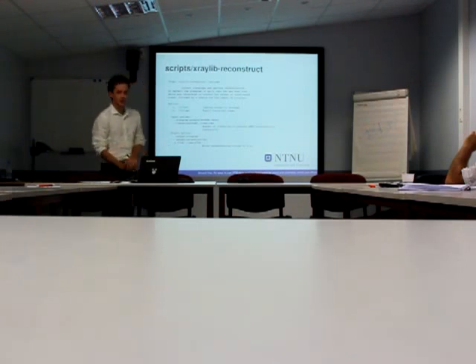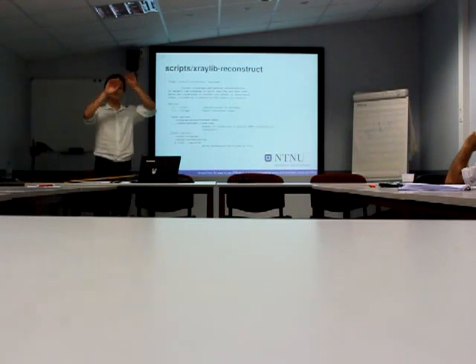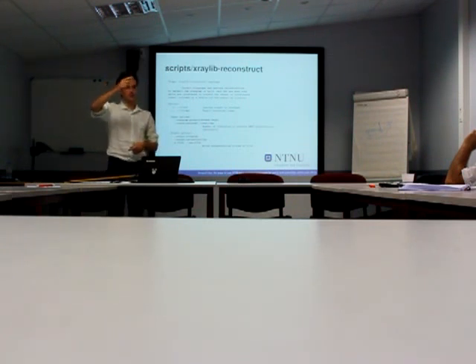So for the corrections, it might be necessary. When you're doing the scans, you often want to scan on the way to the left and the right as you go over the sample to save time. And then what you might have is every odd row in the sinogram will be shifted relative to the even ones.